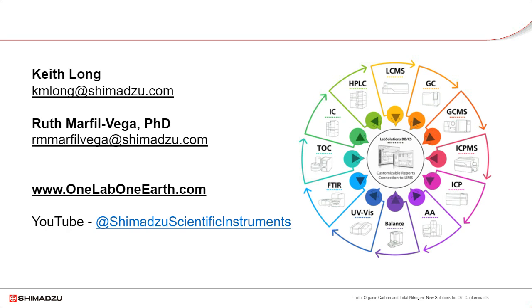Thank you, Keith. There were a few questions in the chat about detection limits, limit of quantification for carbon and nitrogen. I know you mentioned some of them through the presentation. Could you quickly summarize what the detection limits for carbon and nitrogen are?